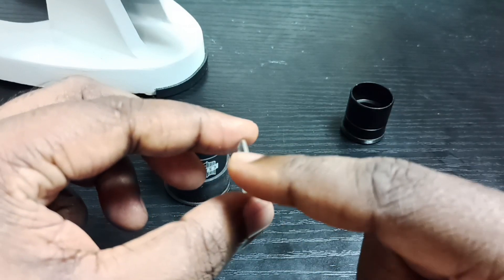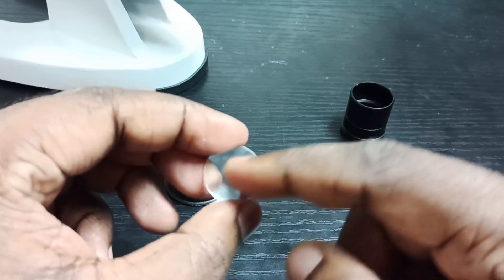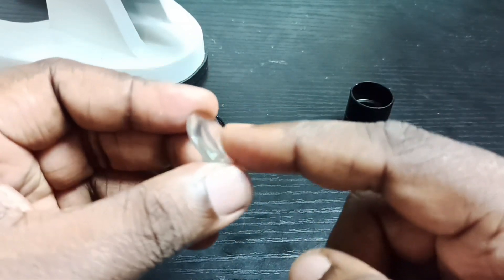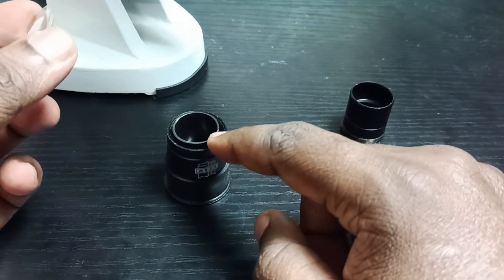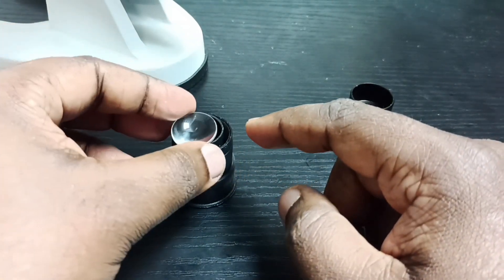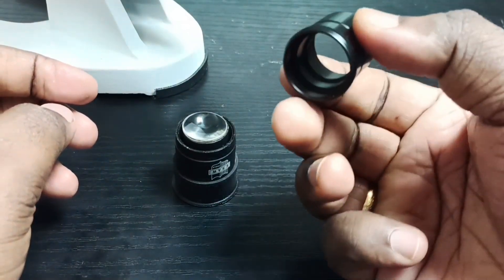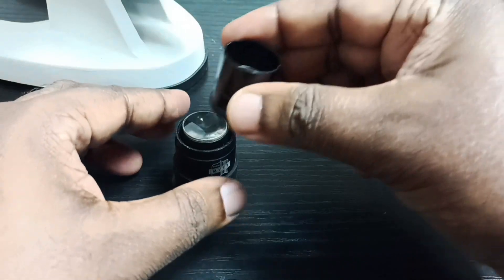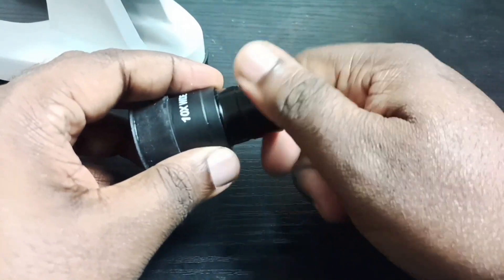In this second lens also, you can see one side has a bulge and the other side is straight. The side which has a bulge — put that side on top of the tube. Done. Then place this final part here and tighten it. Done.